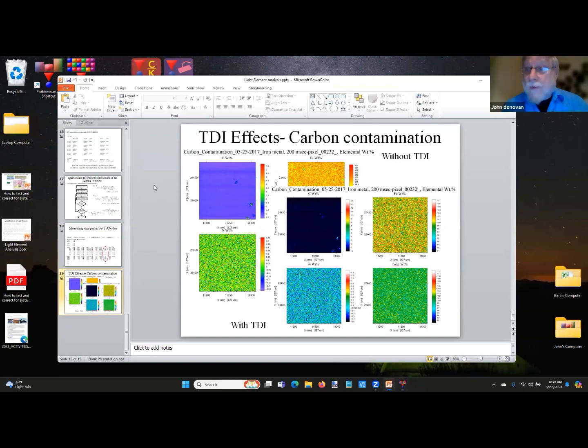Okay, so great question. The full answer is in the 2011 paper in American Mineralogist by Donovan et al., that was with Heather Lowers and I'm blanking on his name now, sorry, one of her students at USGS in Denver. But basically, you do not want to normalize. If you normalize, you're going to ruin your statistical calculations.